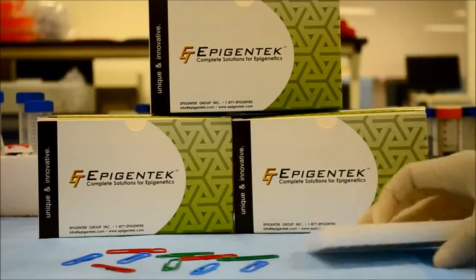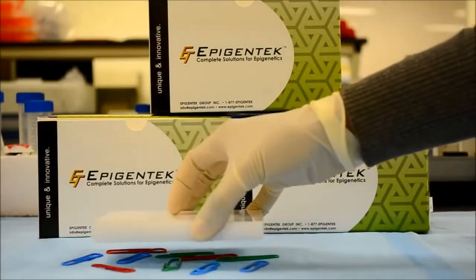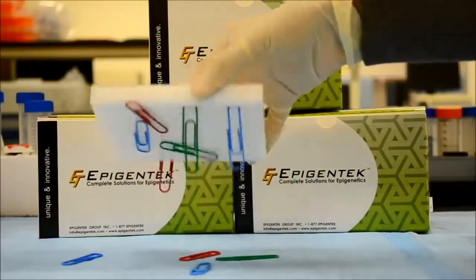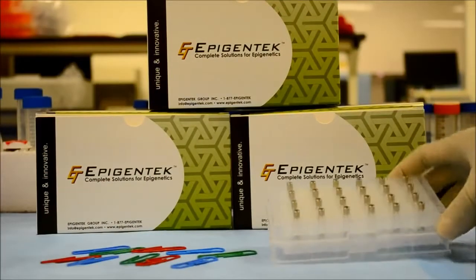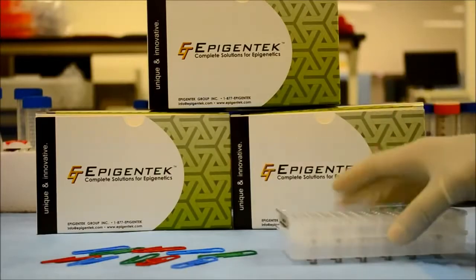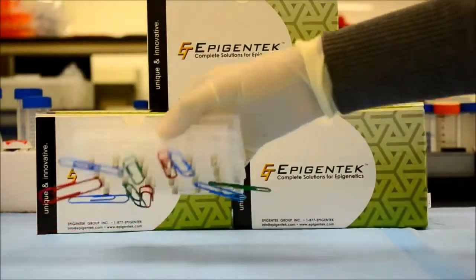Compared to similar products on the market which fall short on magnetic strength and take longer for sample separation with less than stellar results, the EpiMag's neodymium iron boron rods are designed to be extra powerful for ideal results.